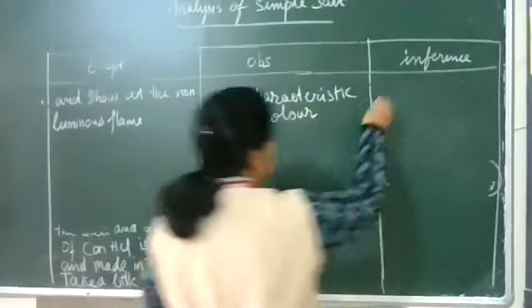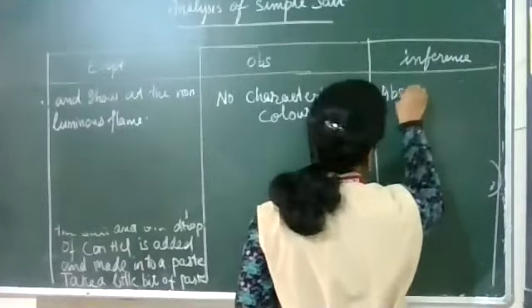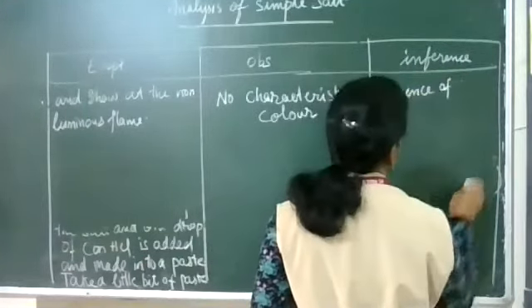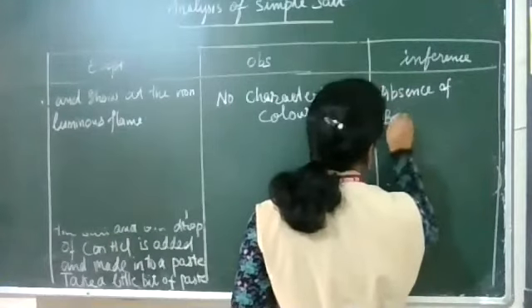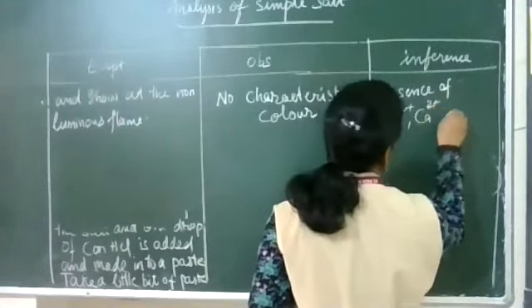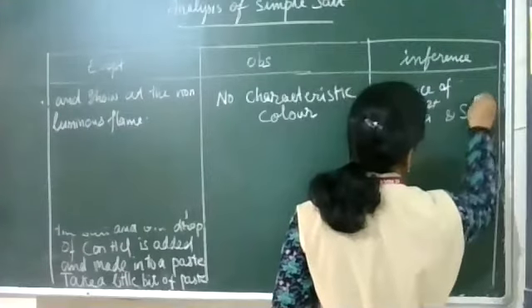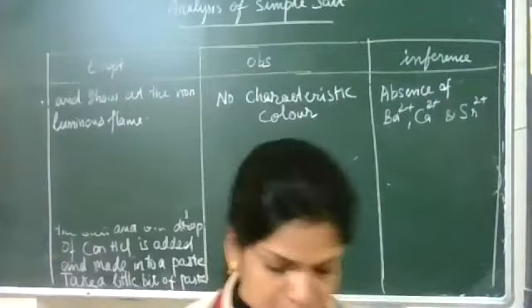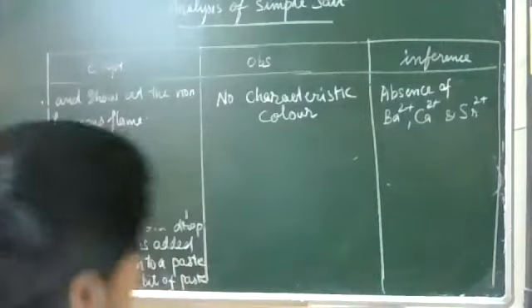So we write: absence of Ba2+, Ca2+ and Sr2+. So this preliminary experiment is over.